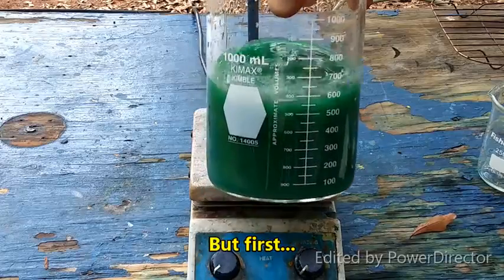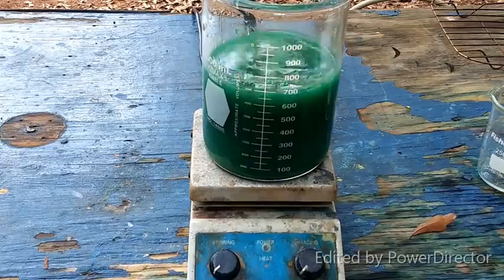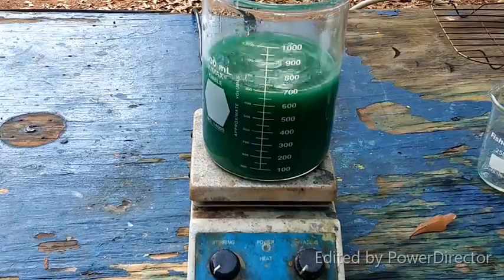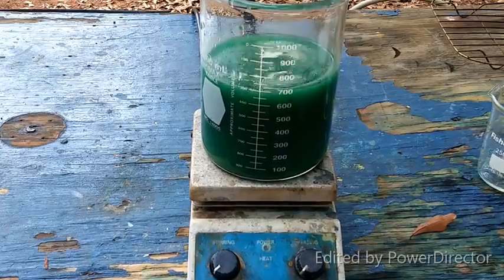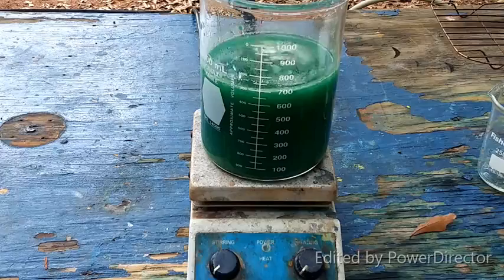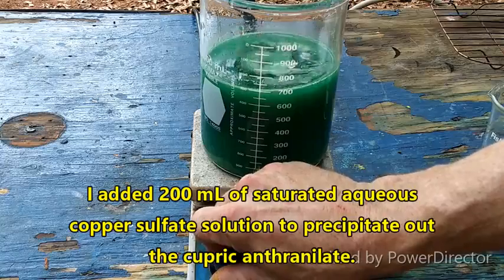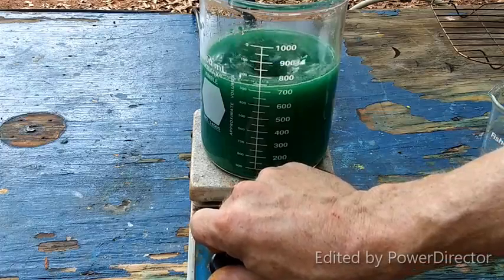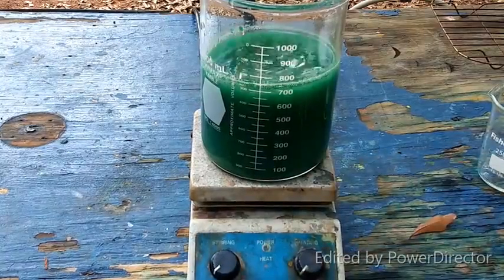Okay, everyone, I did decide to go ahead and make up the copper anthranilate just to separate it out, and like I said, I'm not doing hydrogen sulfide today, but I'll keep this for later, and maybe I'll screw around with it later. So this is what it looks like, though. It's really beautiful. I'm going to let this stir here for a minute and filter it out, and I'll dry that and save it too, and set that aside for another day.